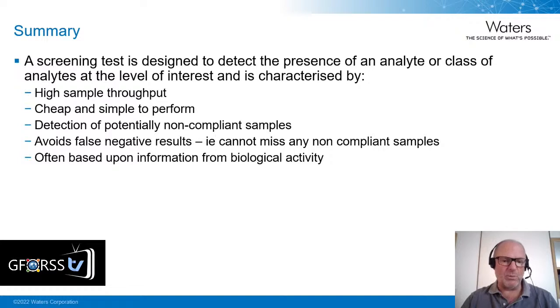So we need to make sure that we avoid false negative results, i.e. a screening test cannot miss any non-compliant samples. And many screening tests are often based upon information from biological activity, which is fine for screening, but it's not providing information on structure.